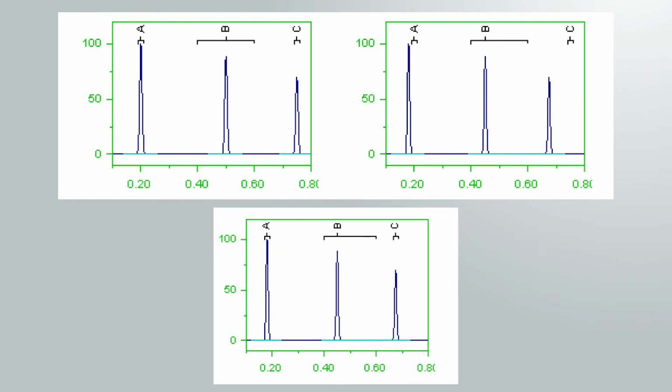Variations in the flow rate of the carrier gas or solvent fall under this category, but variations in oven temperature do not. In difficult situations, it may be necessary to use several components as retention time references, one for early peaks, one for middle peaks, and one for late peaks. The challenge is to find suitable reference peaks in a crowded chromatogram.